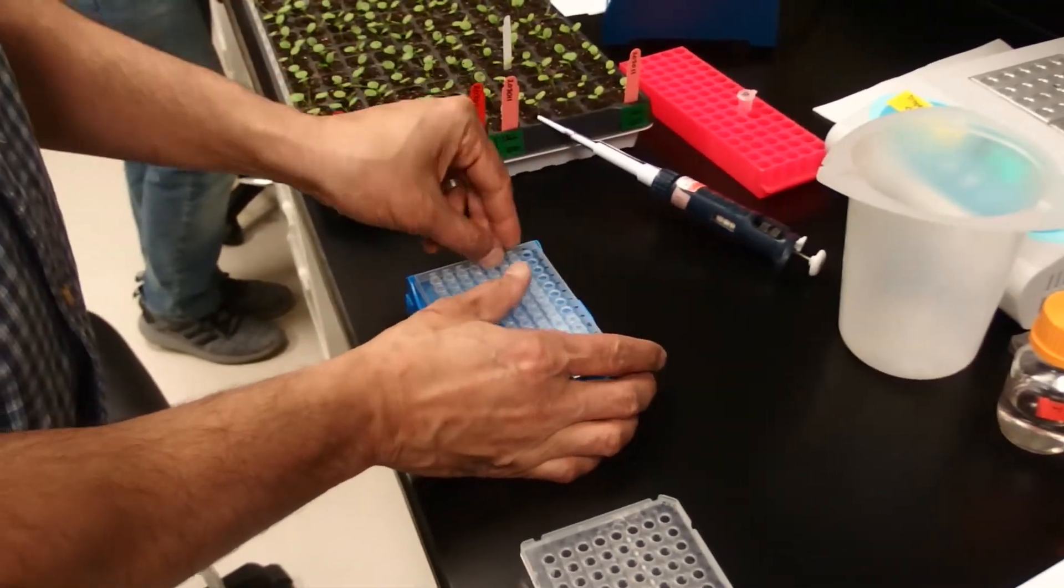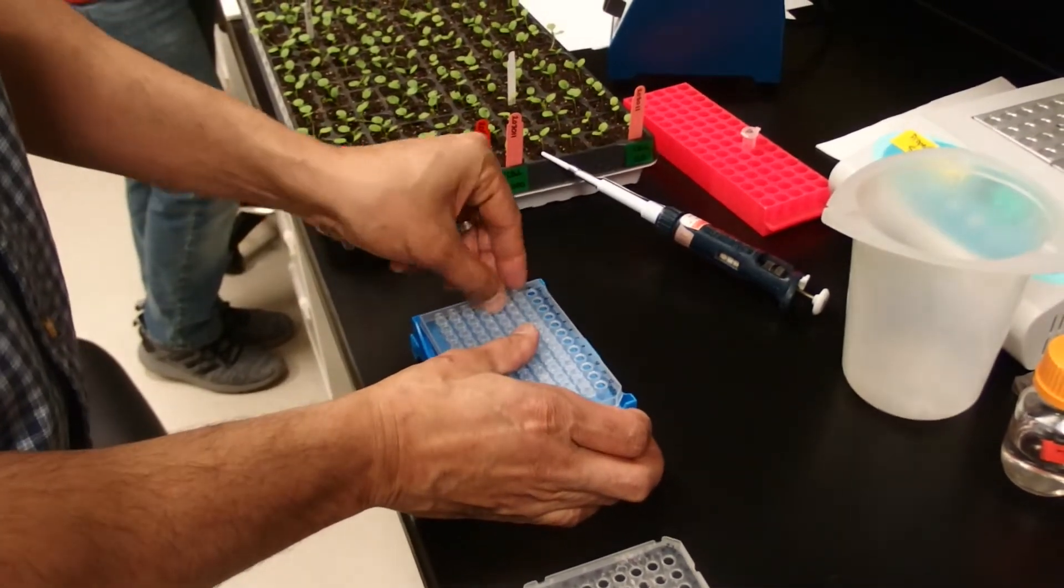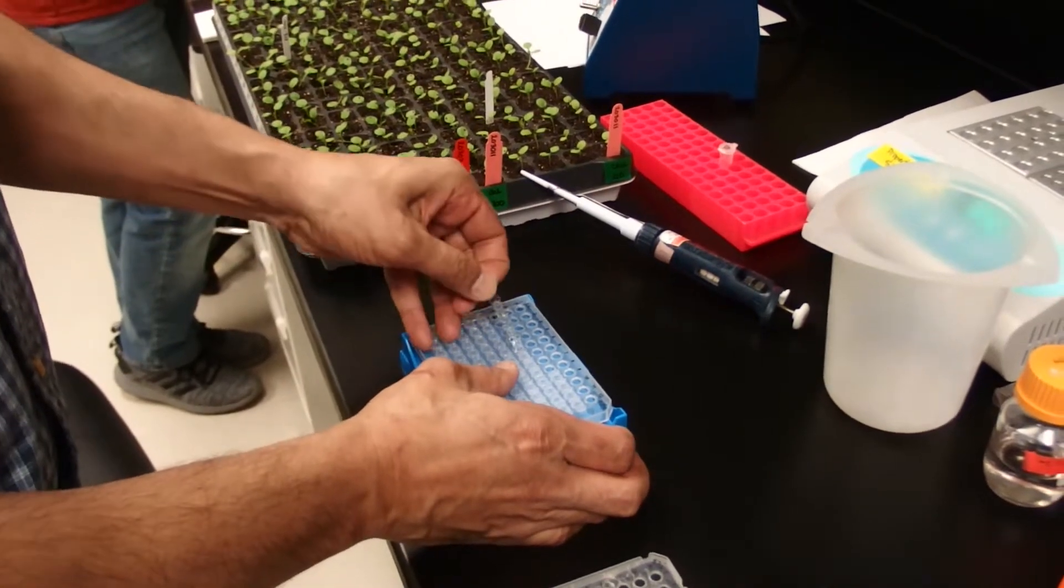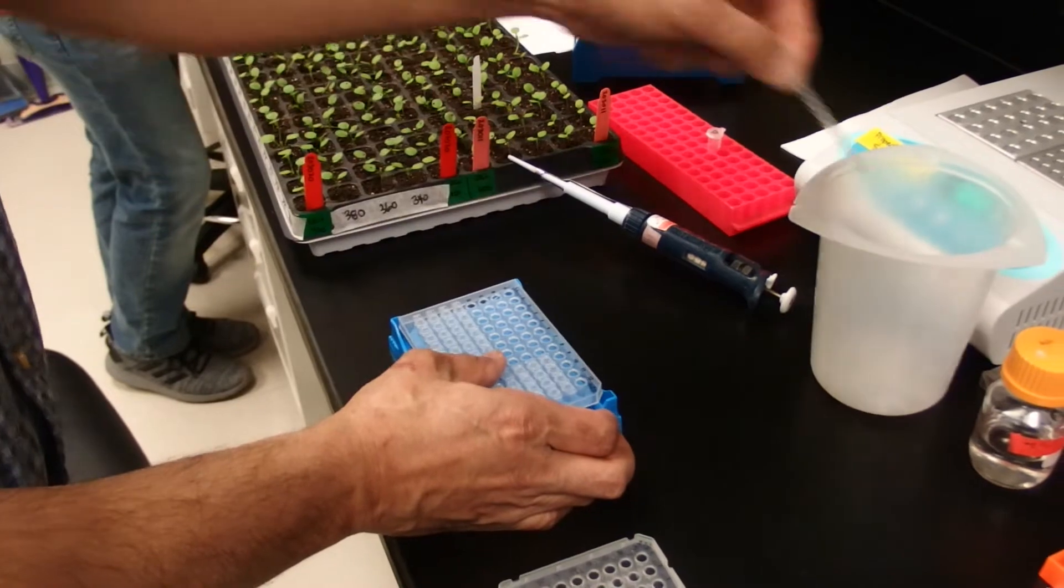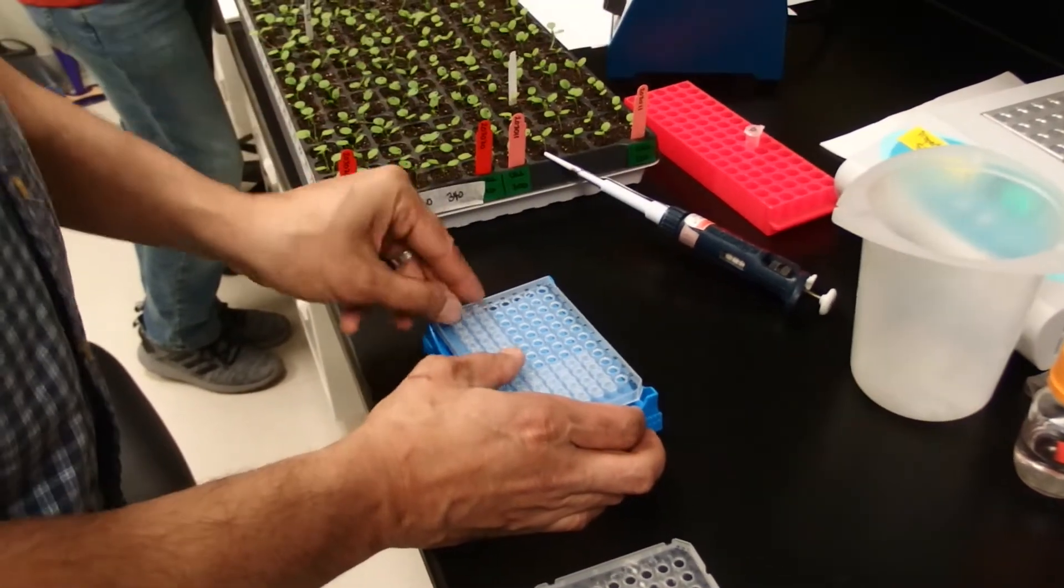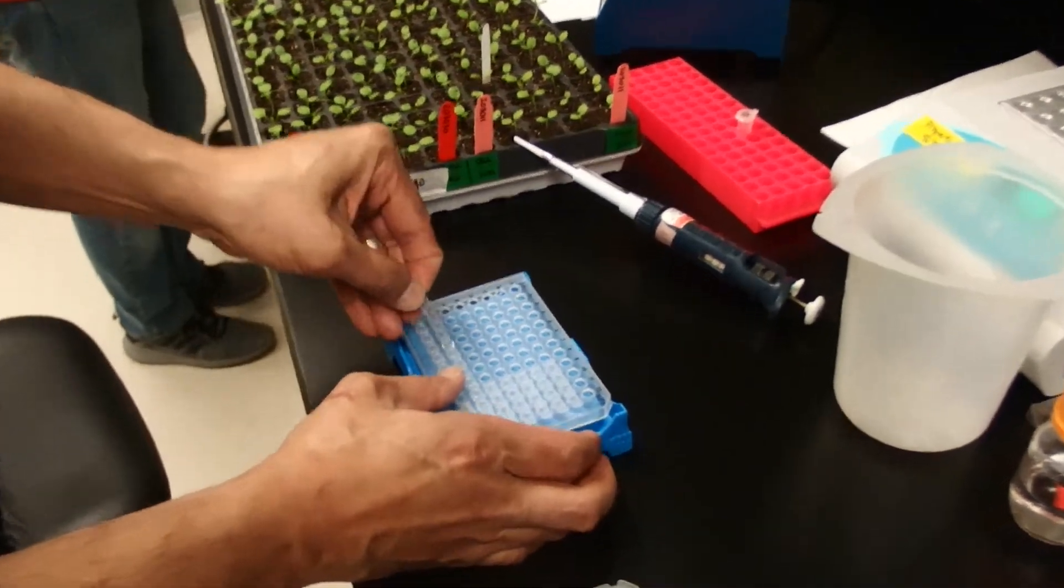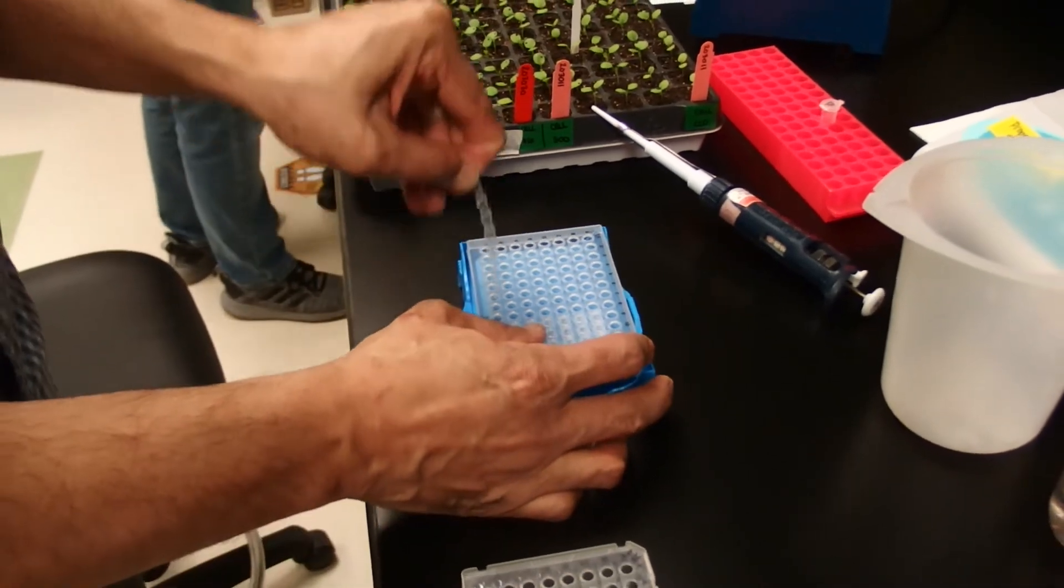They have been spun down already. We will save this and then put a tape over it which is a little easier to handle once you're in a plate format where you no longer really care about individual wells.